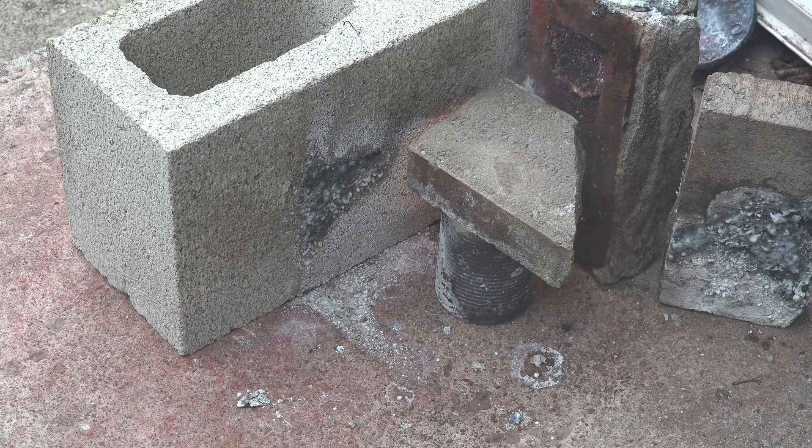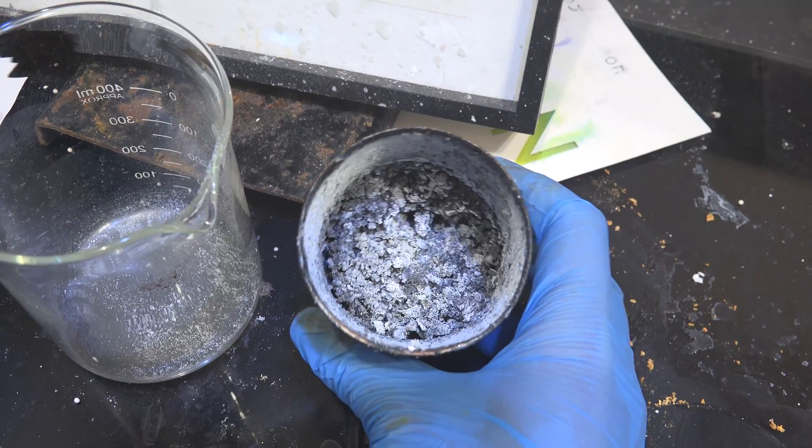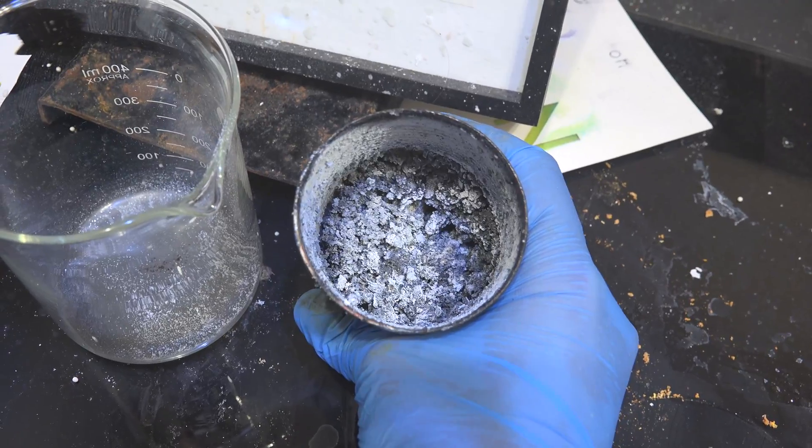Let that cool before handling it. And now we have our mixture of magnesium oxide and sodium metal. The sodium is extremely fine and interspersed throughout the magnesium oxide, so it's almost impossible to see. But it's there.